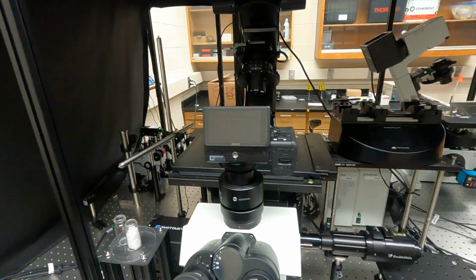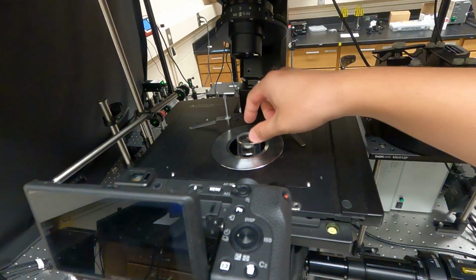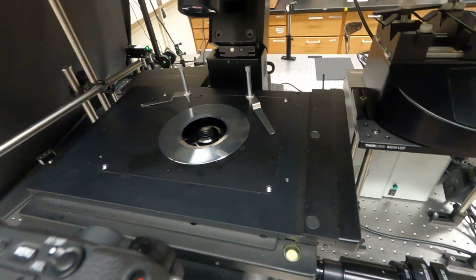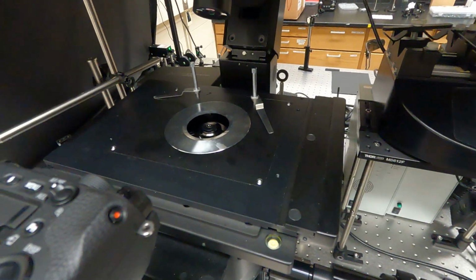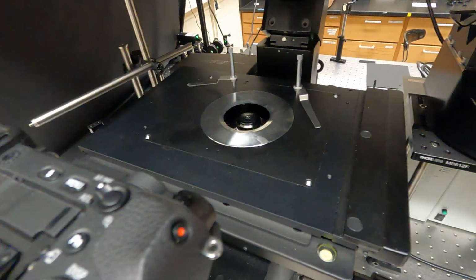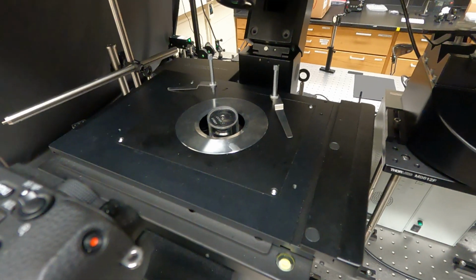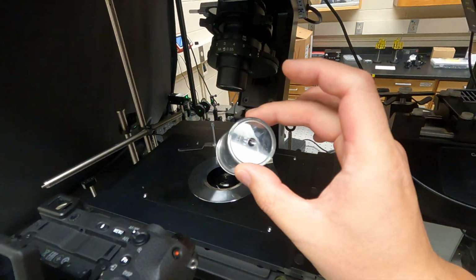Okay, now the laser is on. The next thing we need to do is to turn on the microscope body. The very first thing is to remove this plastic lens cover from the objective. The objective is a very delicate piece of equipment. It's very expensive. We do not want to have it damaged by any means. So when the microscope is not in use, we always use this plastic cover to cover it, so it is protected from dust and moisture in the air. Before we turn on the microscope body, we must remove this cap.